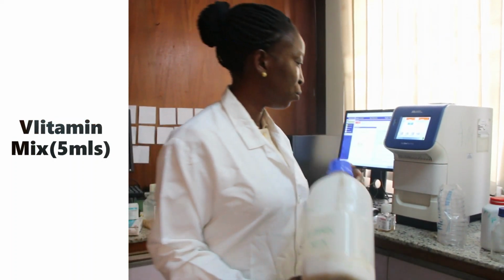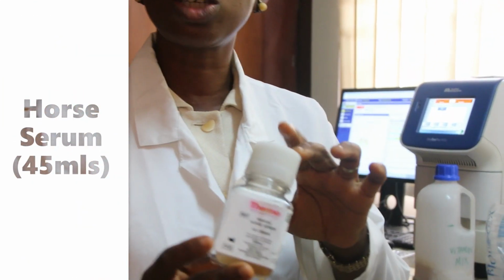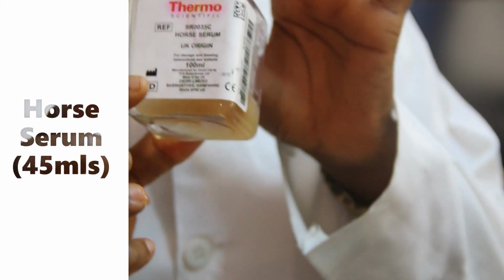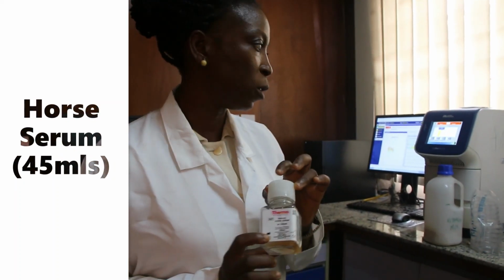So it is highly rich. Apart from the vitamin mix, horse serum or other animal blood products can be added, but horse serum has been in use in Professor Stella Smith's laboratory, and it really gives us optimal growth of H. pylori. So a mixture of 1% vitamin mix and 9% horse serum, meaning that in the 500 ml preparation of GC agar, 5 ml of vitamin mix and 45 ml of horse serum will be added, while 18 grams of GC agar have been measured into 450 ml of sterile distilled water.